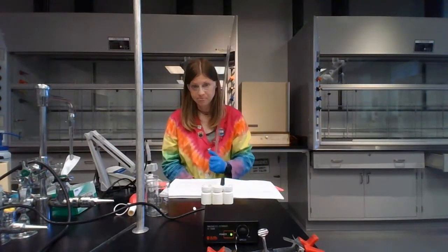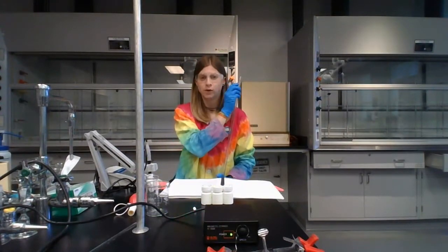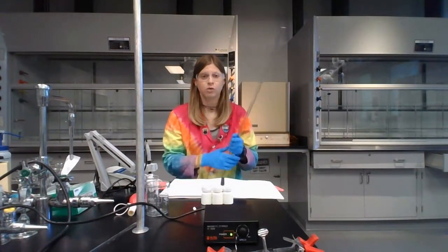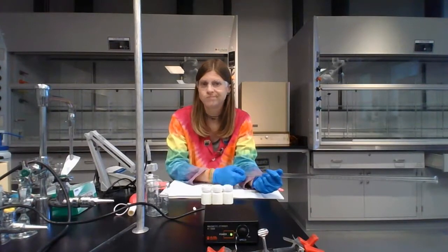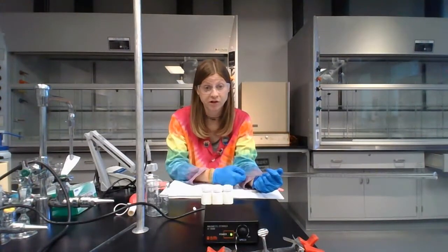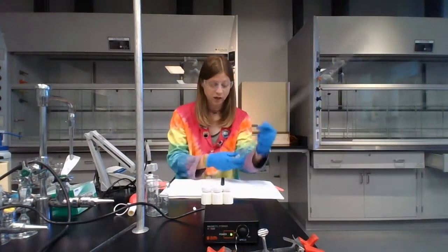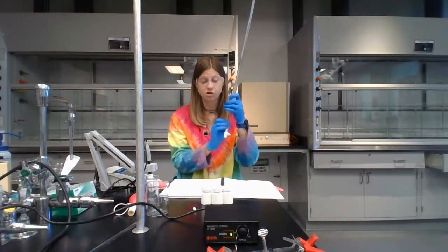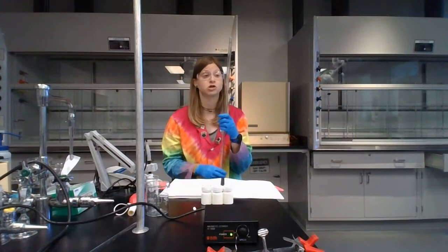For this lab, and this lab only, you do have to fill it to exactly 0.00 milliliters because we're going to be adding liquid in multiple amounts, and it's just to make your life easier. So you will have to add the liquid until that point. Make sure that the tip of the burette is filled with liquid when you're doing this, and that there are no air bubbles anywhere. If there are air bubbles, you are responsible for removing those before you start the titration.